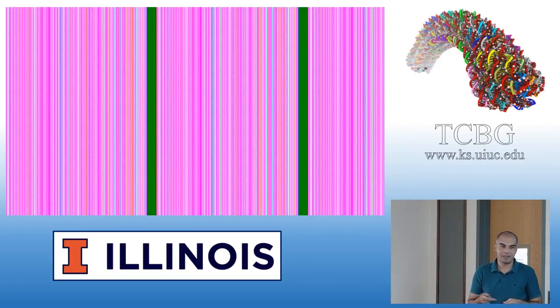So if you're concerned with those kinds of options, say you don't want anything short. Like you have a continuous segment, and I want only everything between 8 and beyond. Or you don't want to even break those short parts that are 7, I just want to keep them. If it's possible, I can put a function that determines that. I think I might have that, like all n, and then you define what that n is.